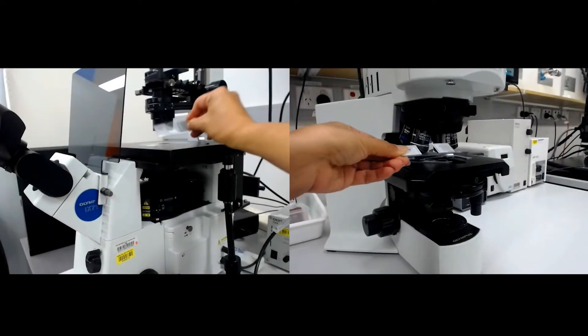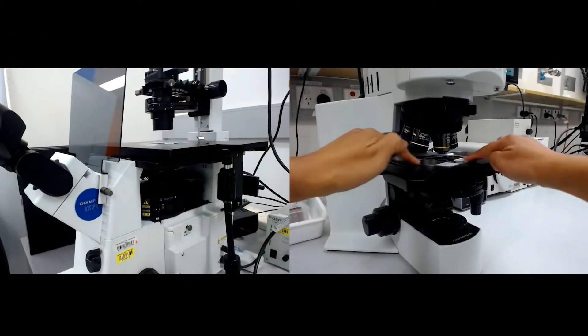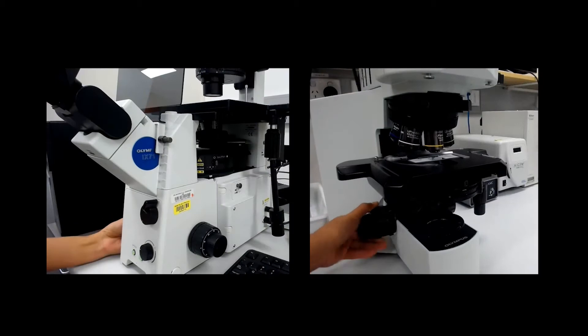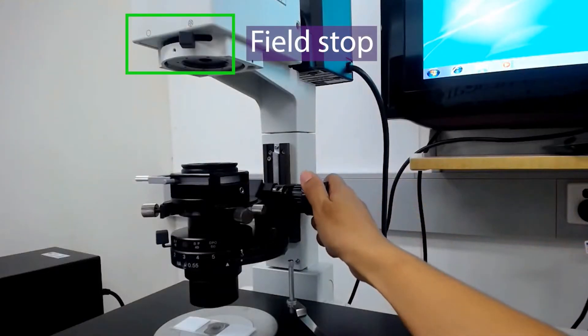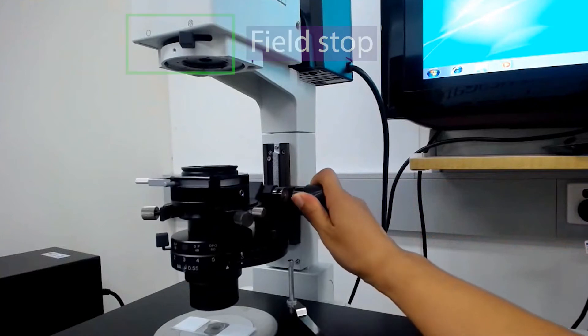Put your sample on the microscope with the coverslip facing the objective and focus on the sample. Adjust the field stop and focus of the condenser to make sure you have achieved Köhler illumination.